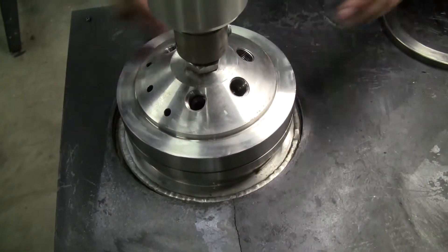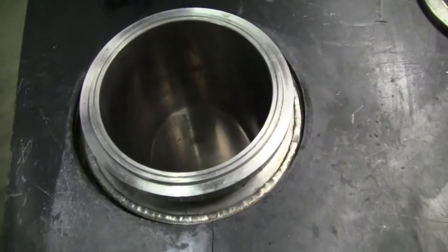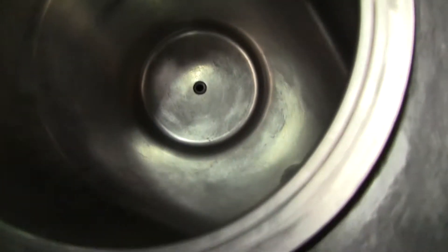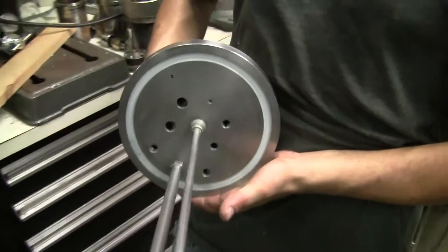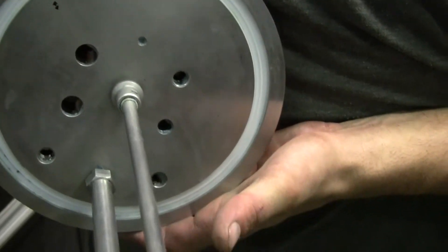There's the ring. Take a look inside — that is sparkling clean. You're not going to find many reactors that are used that clean. Shining more light on the area. Perfect. Thermal couple well, this is the actual impeller blade here.